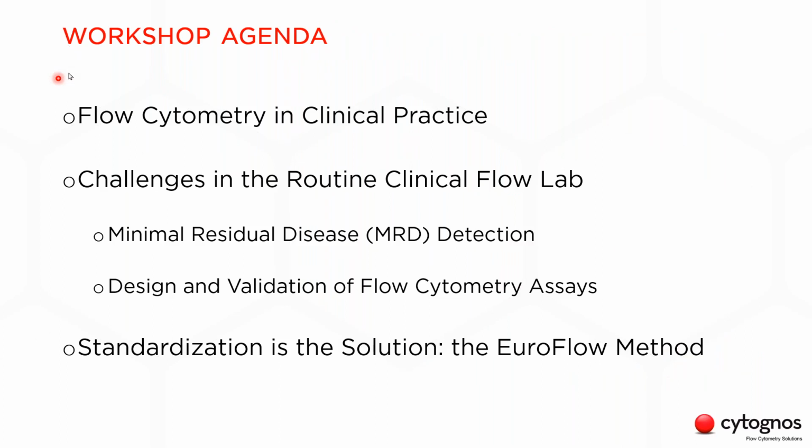So these are the points that we are going to cover today. First, I will start highlighting the value of flow cytometry in clinical practice. Then I will talk about the current issues we face in the clinical routine lab. I will focus on the specific challenges of the minimal residual disease assays and on the design and validation of flow cytometry tests. Finally, we will see how we can overcome these challenges with a fully standardized solution, which is the EuroFlow method. And then at the end of the webinar, as I mentioned, we will have some minutes for any question or comment that you might have.